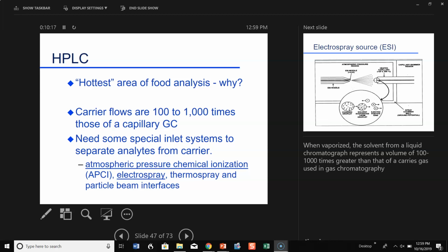But this is interesting. So, gas chromatography has reached theoretical limits. It will never improve any further in separation. Liquid chromatography hasn't gotten there yet. And that's why we're seeing it as being really an area of innovation. It's kind of a little bit behind. It can make all these improvements, innovations even in the future.